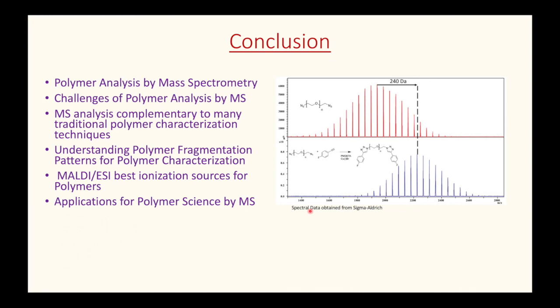As an example, if we considered proteins and peptides that are involved in the viral replication of HIV, and we were to subject these proteins or peptides to mass spec, we would be able to determine their fragmentation pattern. By interpreting the fragmentation pattern of those proteins, we could possibly identify potential areas where the amino acid sequence could be targeted with drug inhibitors, so that we could inhibit its replication from occurring.